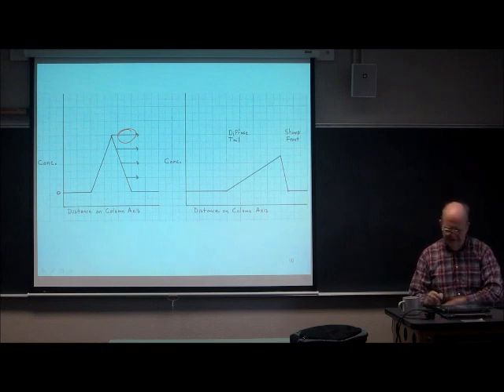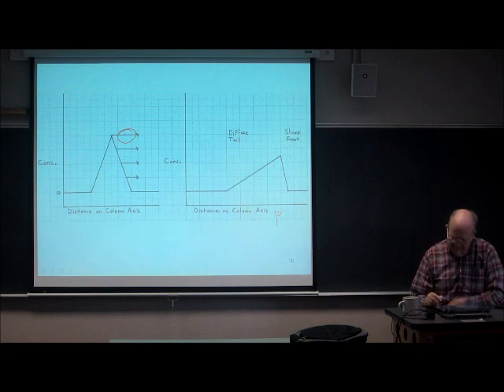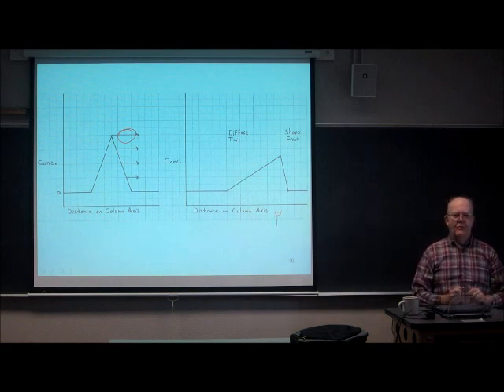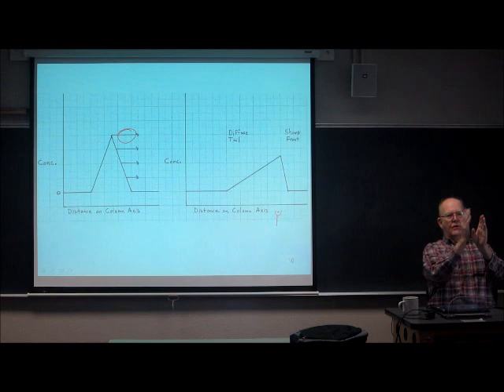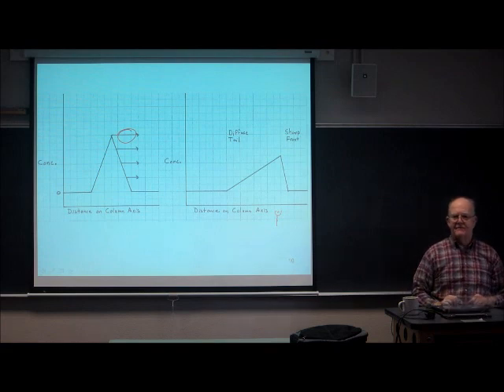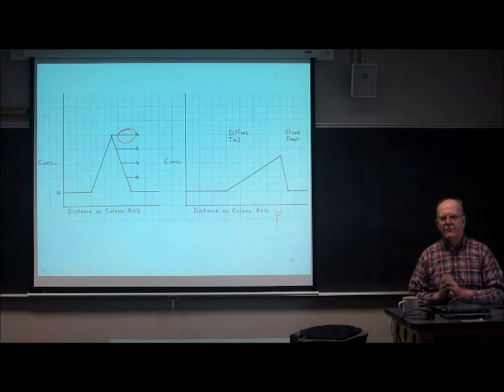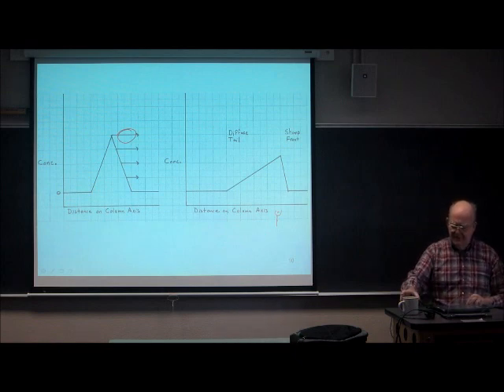Now, let's put a detector right there. There's our detector. What's it see? It sees, whoa, there's a really sharp front, and then a long tail. So all the stuff I just told you about back on that first slide is a consequence of the fact that the molecules move with different velocities. And that's it.